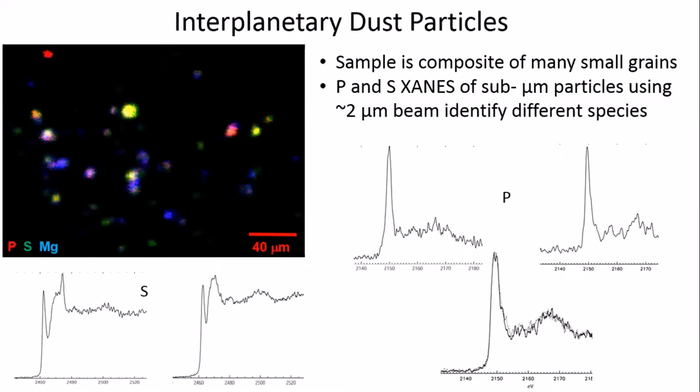We have beam damage issues even in glass, and have been doing things like defocusing the beam, trying to reduce the flux, the photon density on the material. And can you explain again the technique you're using here?